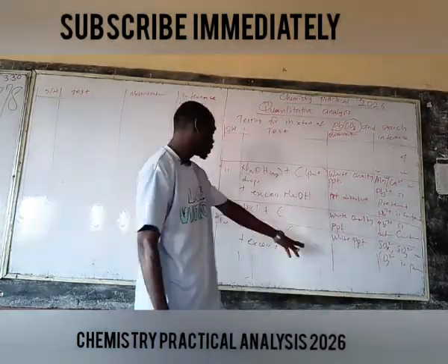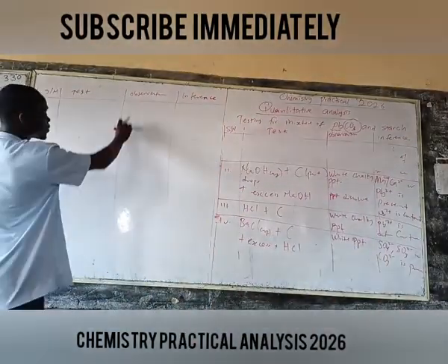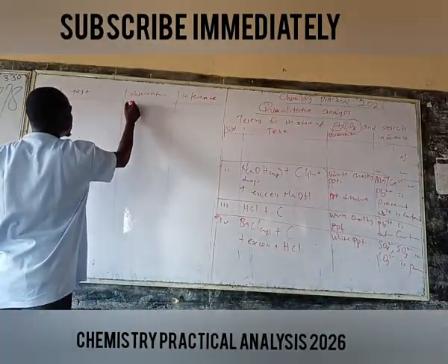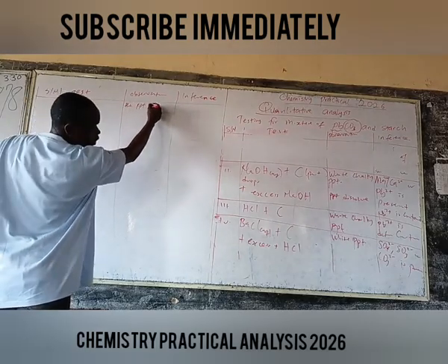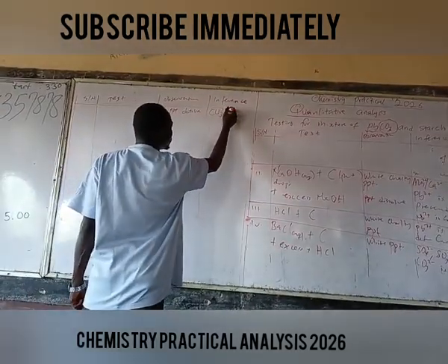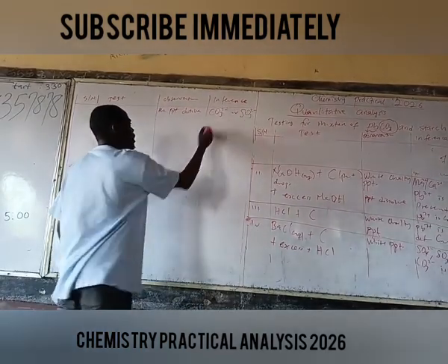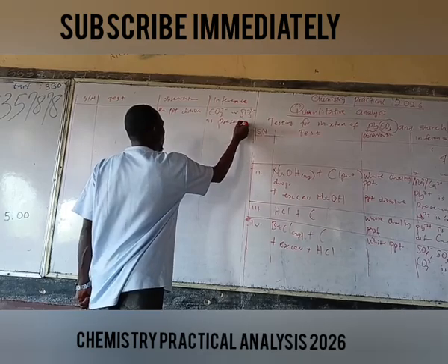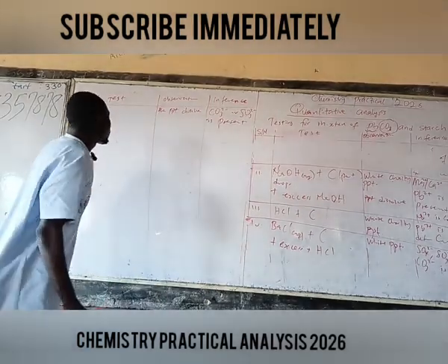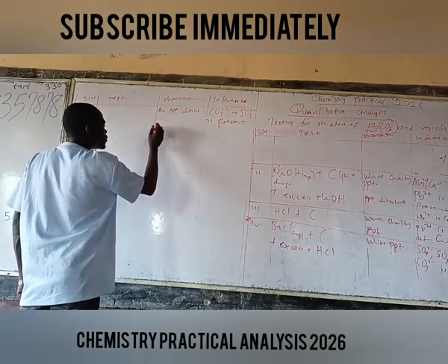Now, because we are working directly on this CO3, we say under observation, the precipitate dissolves. So then we go back to CO3 2 minus, or SO3 2 minus is present. Now, adding the HCl, something must be observed.